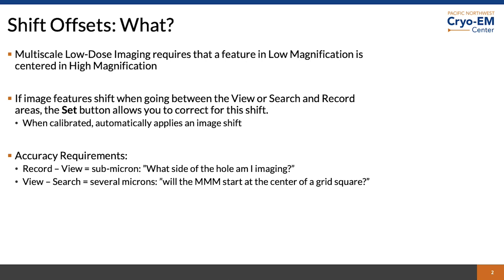If an image feature shifts when going between view and record or search and record, you can use the shift offset to adjust. The shift offset is a stored image shift offset that is automatically applied.